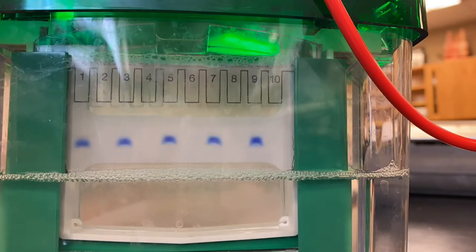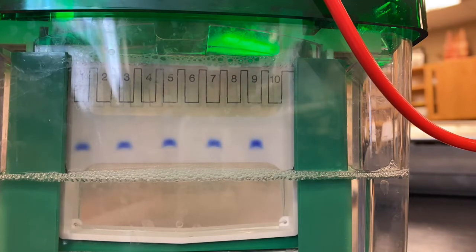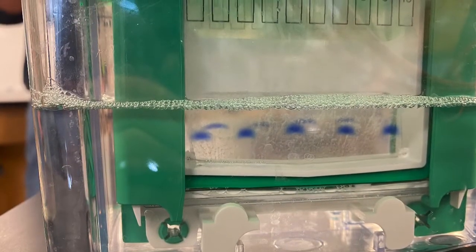Smaller molecules migrate through the gel more quickly and therefore travel farther. Larger molecules migrate more slowly and therefore travel a shorter distance. Each one of these gels was run at 150 volts for 40 minutes.